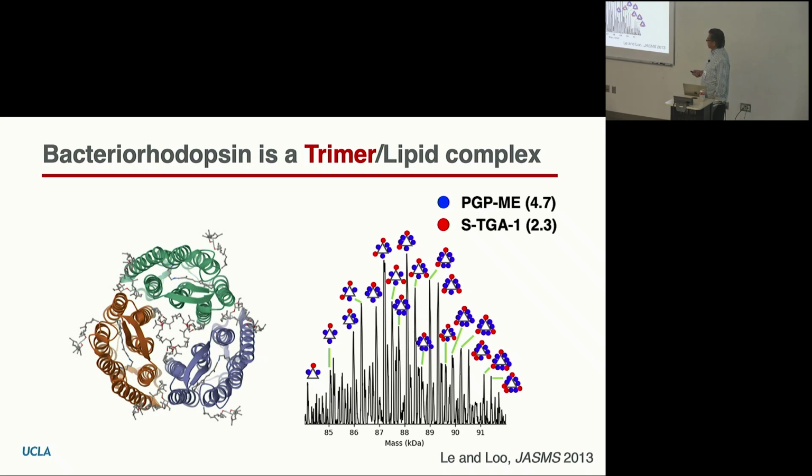Right. Okay. So I didn't tell you the backstory. So the backstory is that bacteriorhodopsin, this particular sample, was used in the development of cryo-electron microscopy. So in the 70s, when people were thinking of cryo-electron microscopy, this was one of the first samples that they tried. And when they eventually got some electron density that looked like the protein, they saw some extra density that they couldn't assign at the time. And so this whole slew of researchers went about trying to figure out if this was lipid or not. And they determined that these two particular lipids were most likely present in the cryo-electron microscopy study.